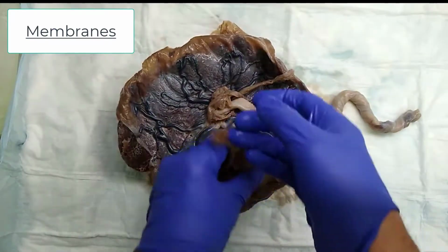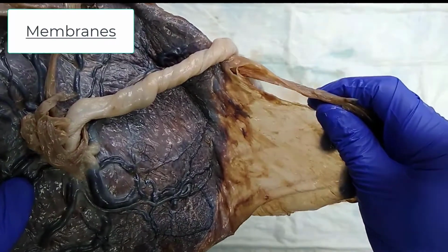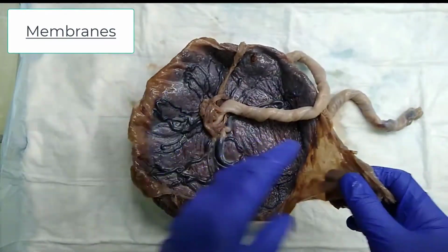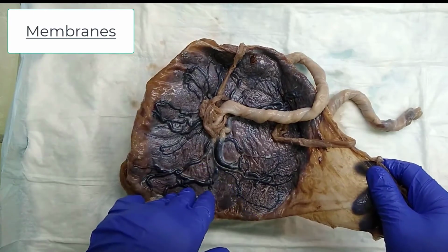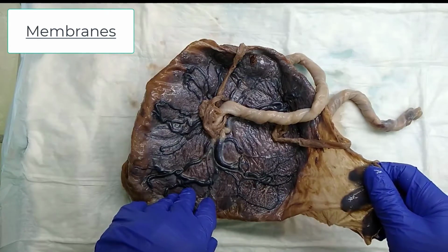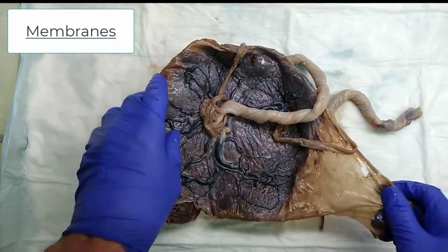The membranes generally have a transparent appearance, or at least a non-opaque appearance, but there can be various abnormalities in the membranes, which include meconium deposition from meconium passed by the fetus, or signs of acute ascending infection, in which case the membranes contain lots of neutrophils and become cloudy.